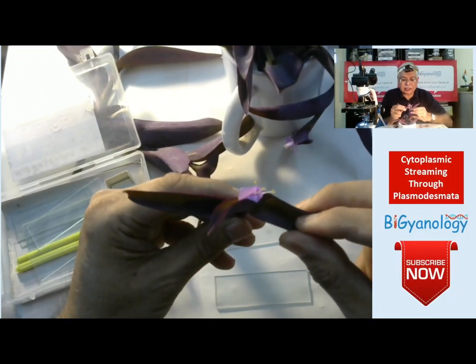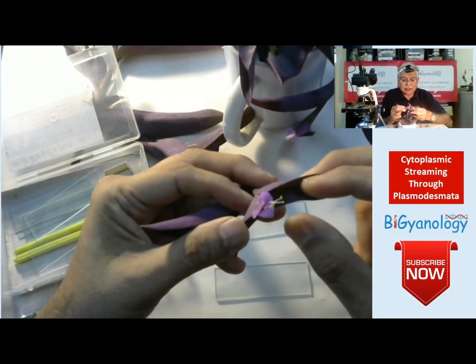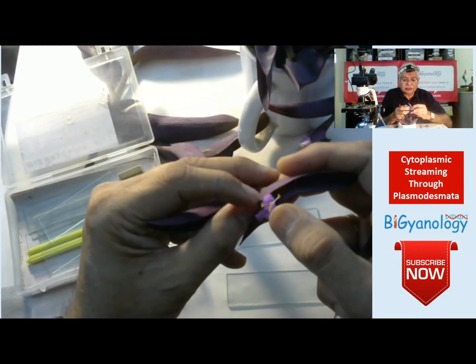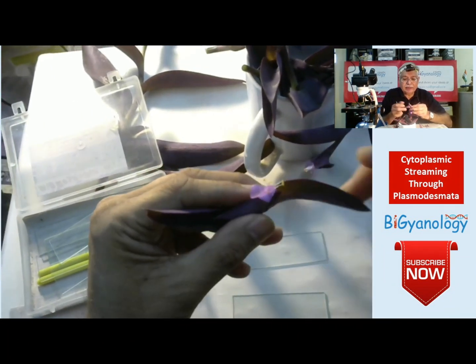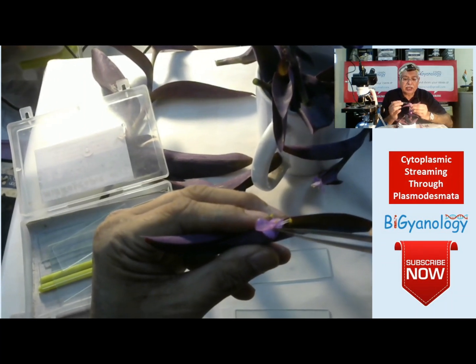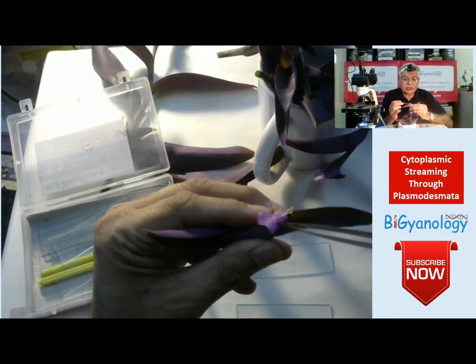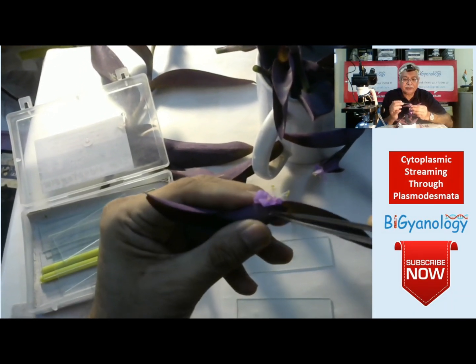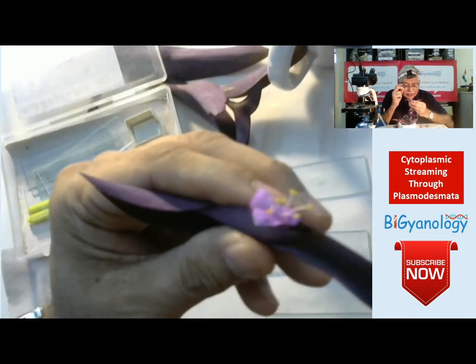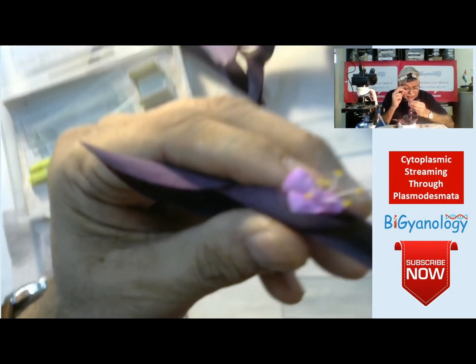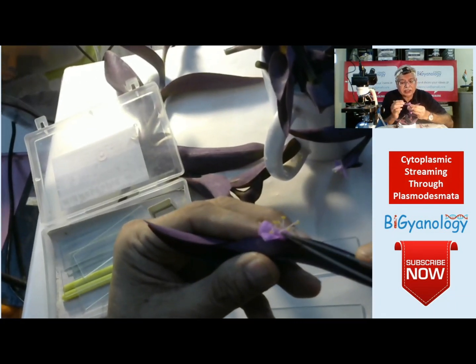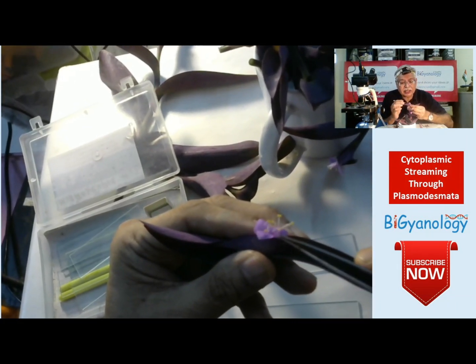The purple heart or Tradescantia leaf — and this is the flower. When we see the flower we need to understand that the yellow anther is what is the stamen. We need to get the base of the stamen. We have to find the base which has hair — there is a lot of hair at this base, I will show you.